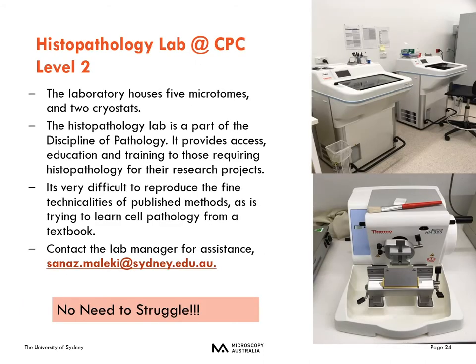Although we don't have all the processing machines at SMM, there's always help around the corner. Here is the histopathology lab at CPC level 2. You can contact the lab manager, who will offer training and help for histology sample preparation. There's no need to struggle.